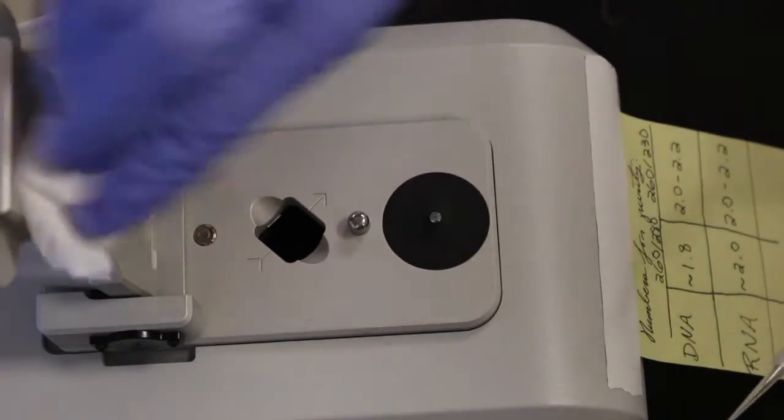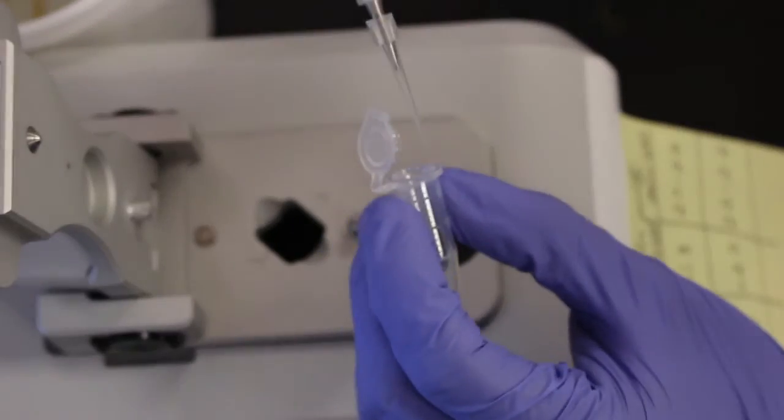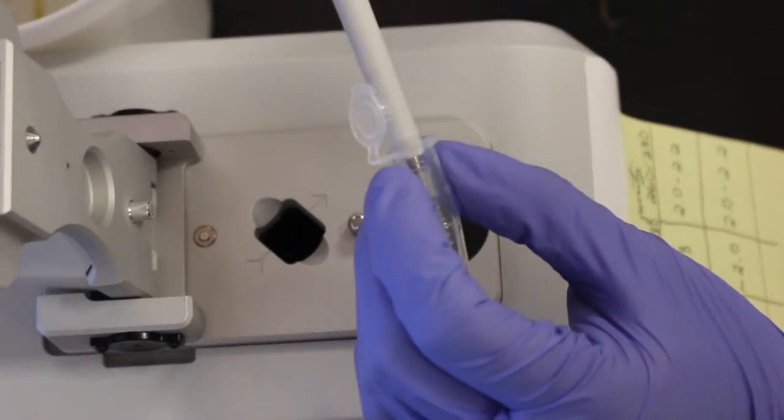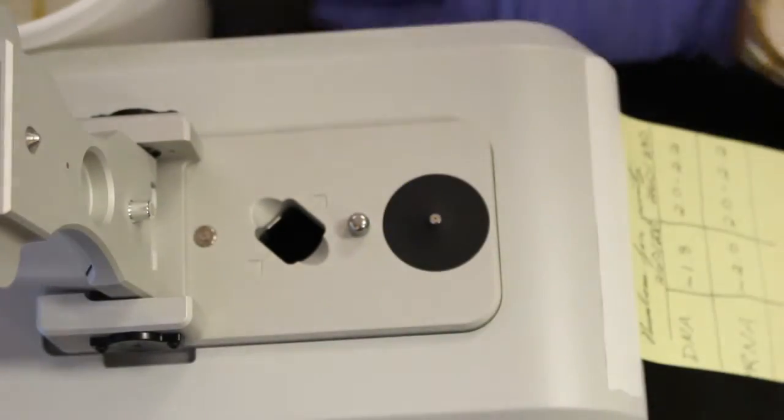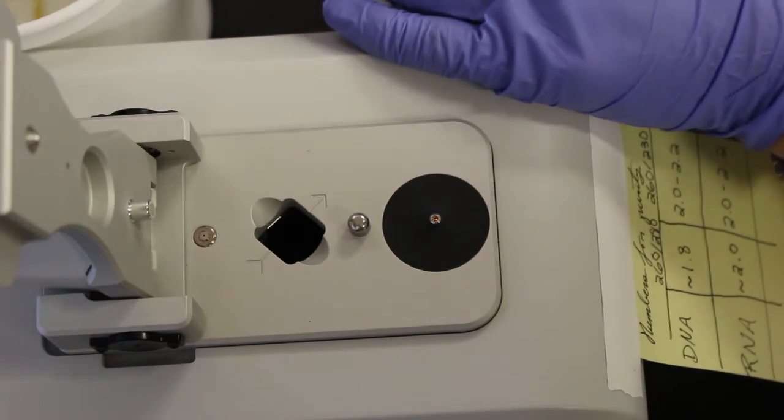The best way to load liquid samples is to push down on the pipette to create a small sphere of liquid on the pipette tip, and then place the liquid sphere onto the metal tip. Close the arm gently, and make sure after each measurement to clean off the two metal tips with the Chemtech wipe.